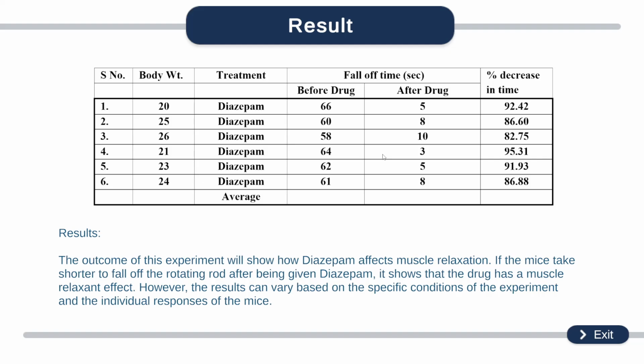I hope that you have learned a lot in this video about the effect of diazepam and about using the Rota-Rod apparatus for the mice.